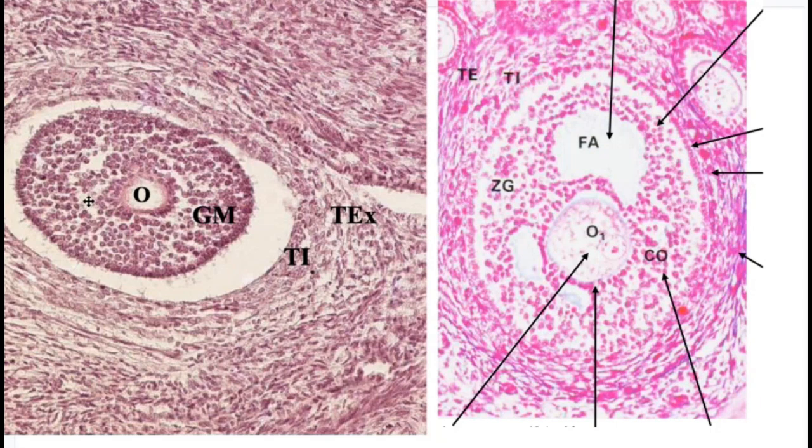These are some examples of what secondary follicles are going to look like. You'll see these white spaces, which is the antrum. You'll see the oocyte. Here you're going to have your zona pellucida. Your follicular cells are here, making your estrogen. Here you're going to have your theca interna cells, making your androstenedione. Again, they came from the spinocellular connective tissue.